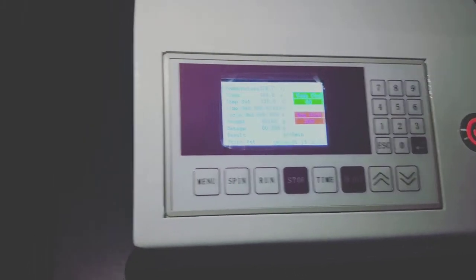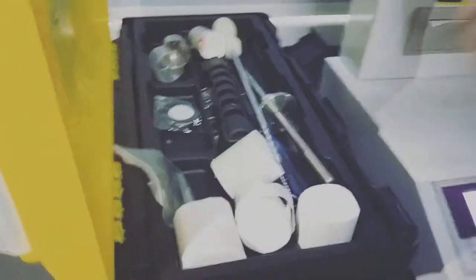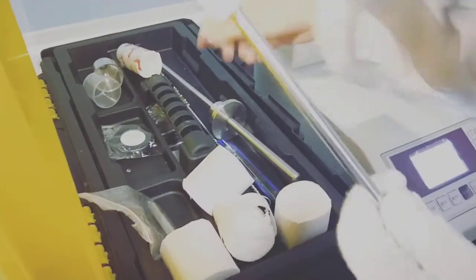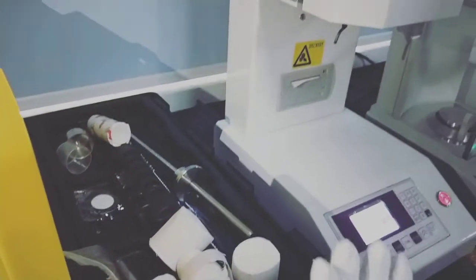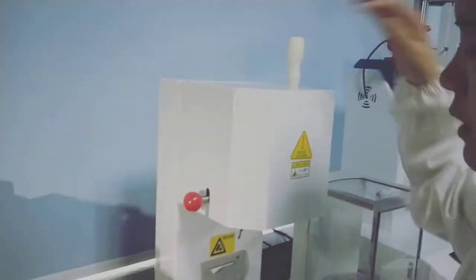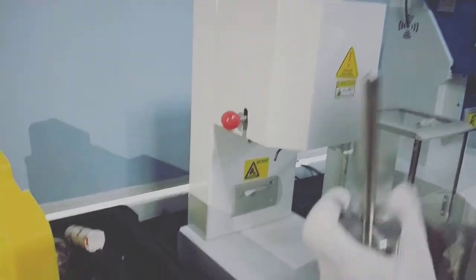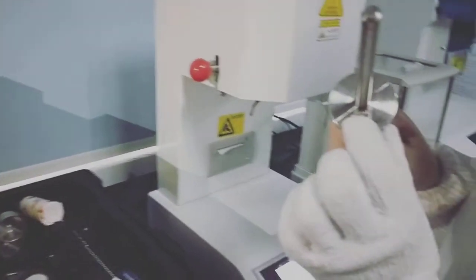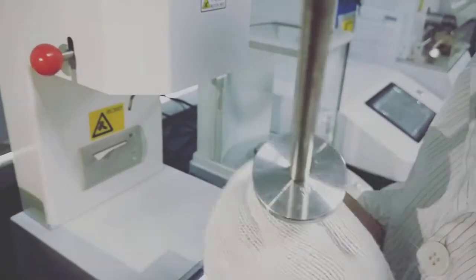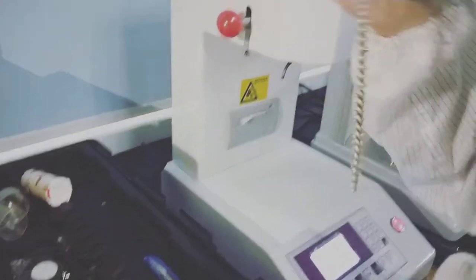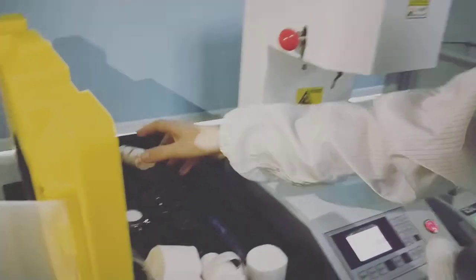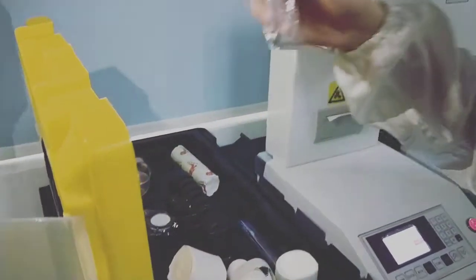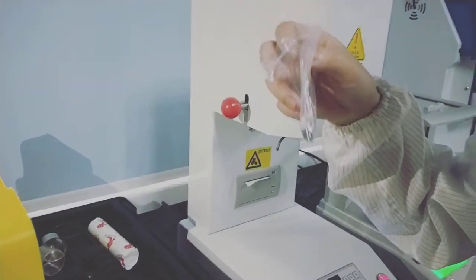This rod is used for cleaning the sample tank. And this one is used for adding weights. This rod already has 325 gram weight. And this is used for cleaning the sample tank too. And here is the die and the die cleaning tool.